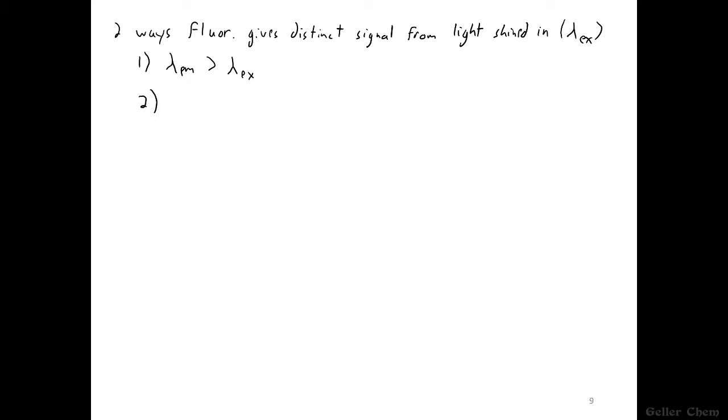So let's write that and then see what I mean. Detector is perpendicular to path of light shined in.